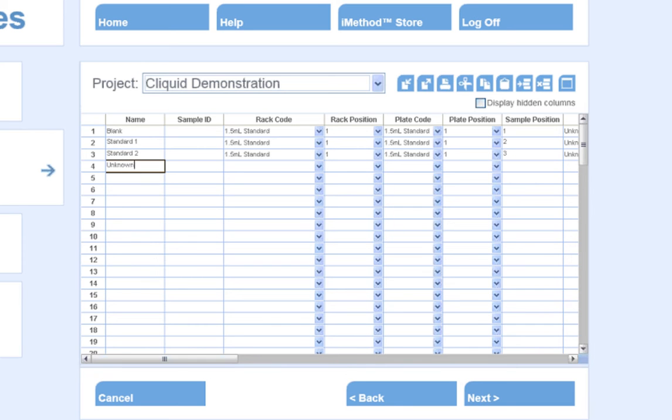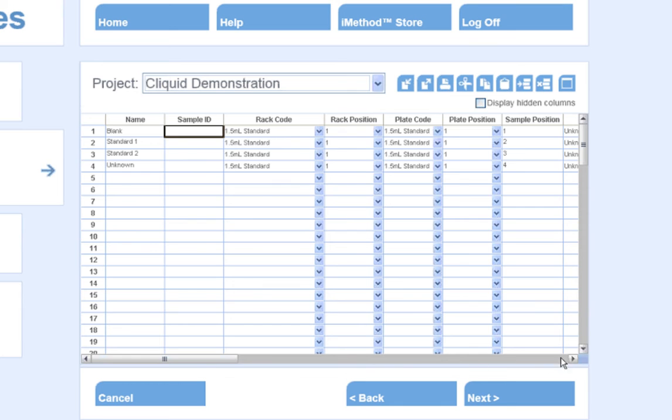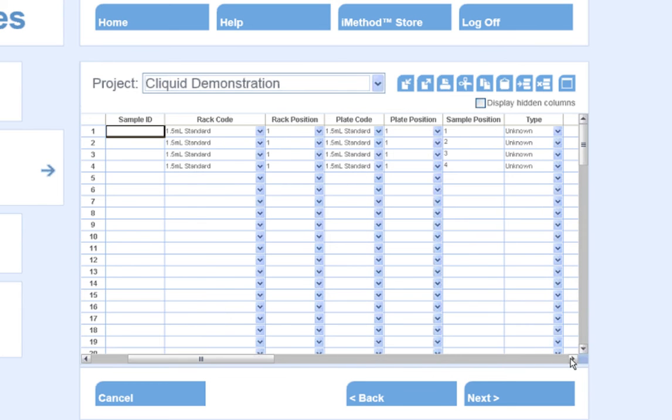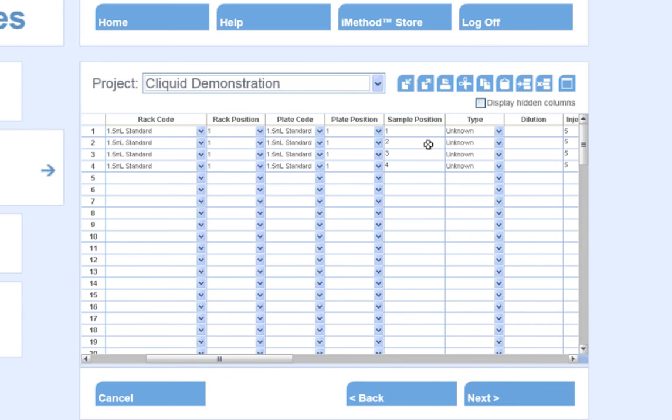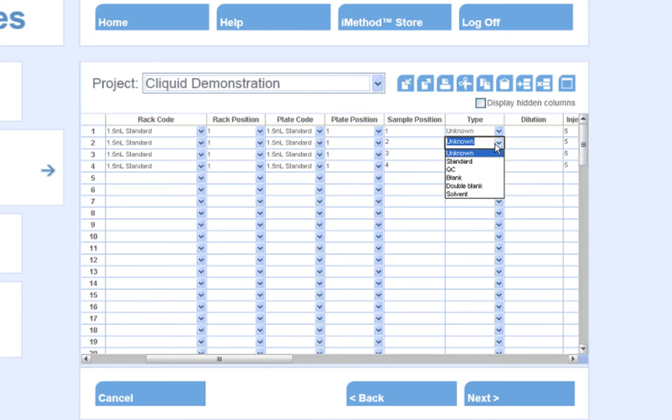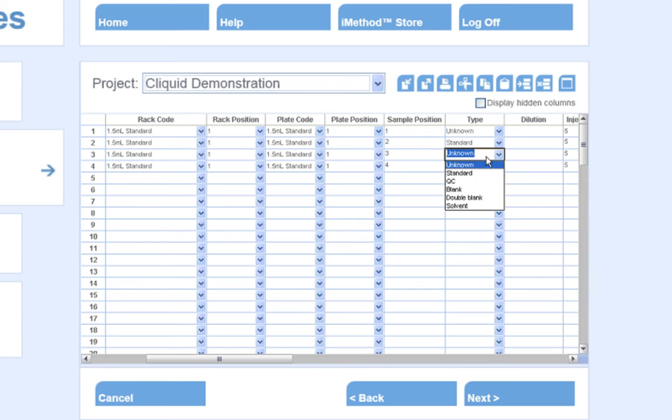The sample ID column is useful if I have a LIM system that requires unique sample IDs. I will also ensure that I am placing my samples in the proper auto-sampler location, and I will set the sample type, such as Standard, for the two standards I am submitting in this sample set.